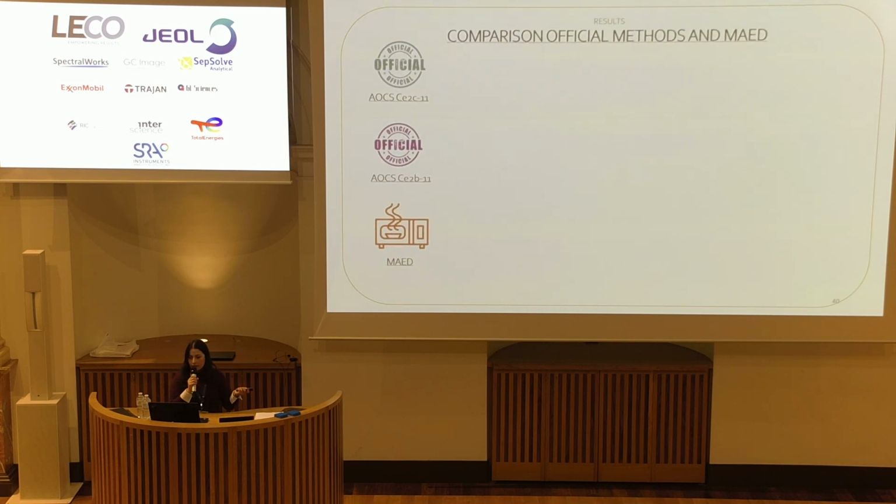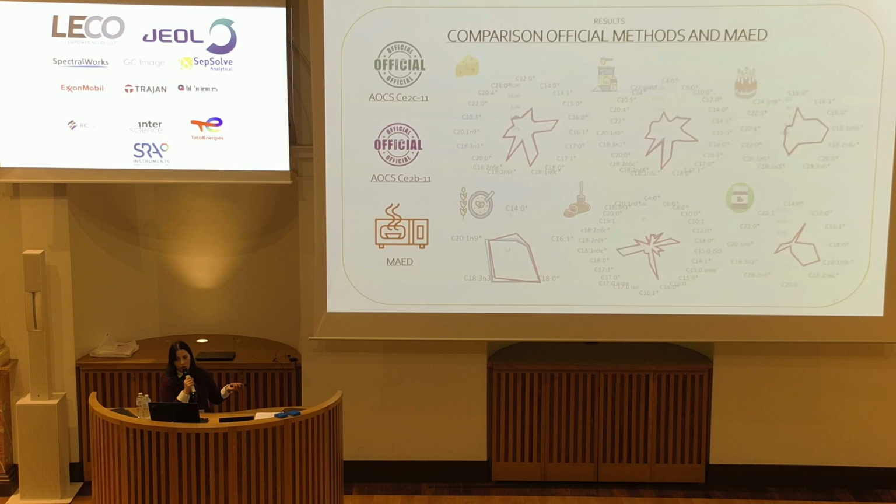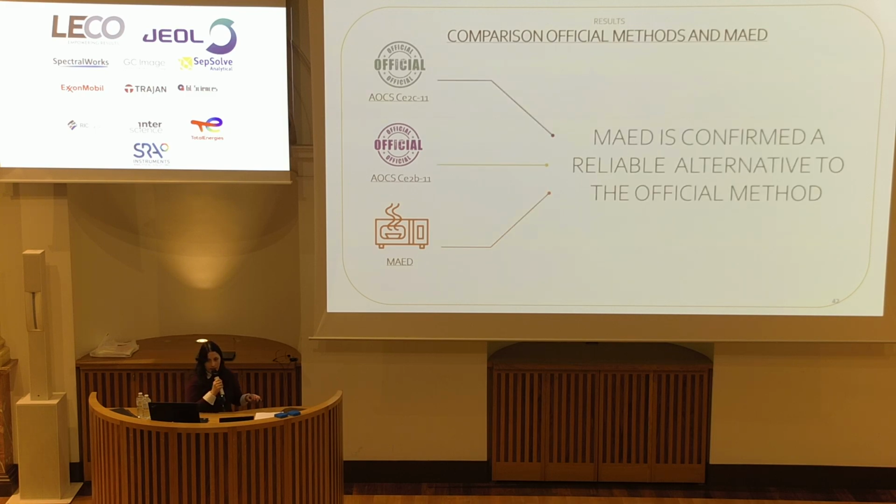As we can see from the percentage profile of saturated, monounsaturated, and polyunsaturated, all 3 methods perform exactly the same, so the results are completely aligned, and also if we compare the single fatty acids detected in all the matrices. So for the first objective, we can say that MAED is confirmed as a reliable alternative to official methods.